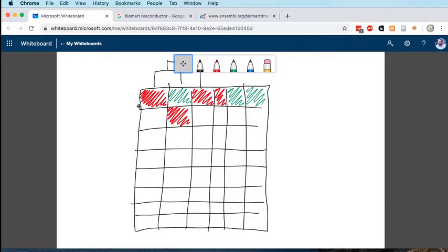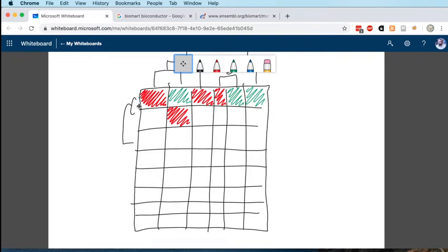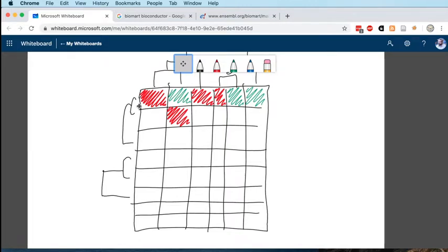So we will end up with a dendrogram linking the samples together, but also the genes as well. So we'll have different clusters of genes drawn out in our heat map in various ways.